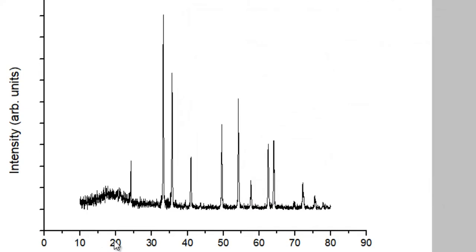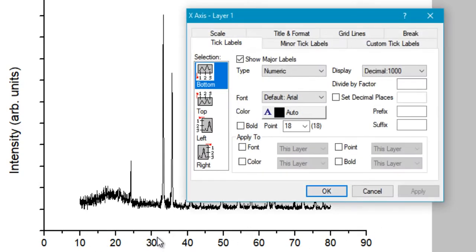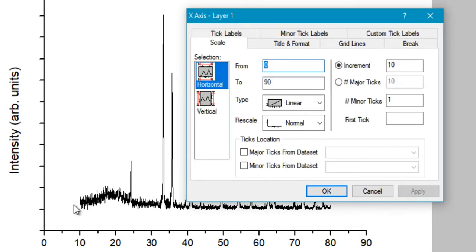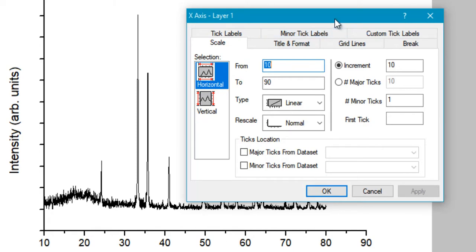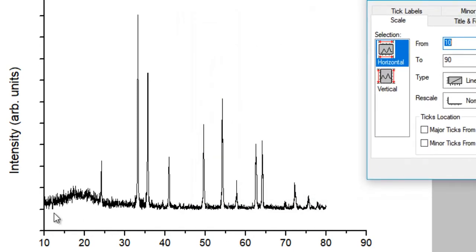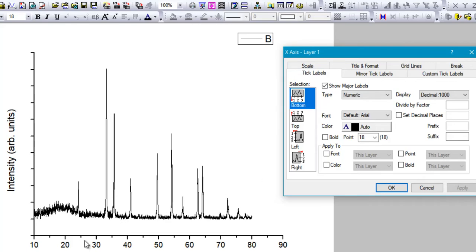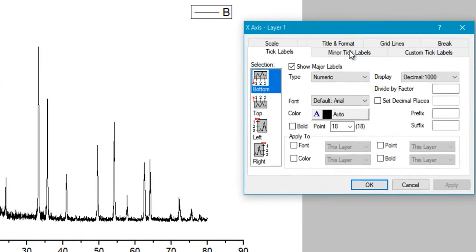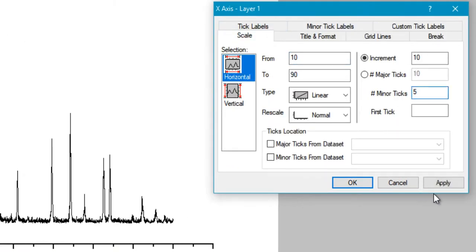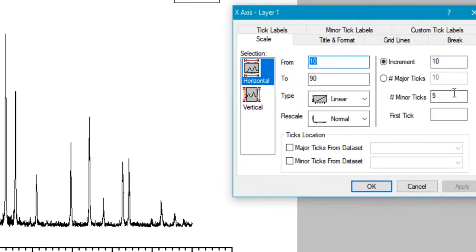Next, edit the X axis. Since my X-ray diffractometer scan started from 10 degrees to 80 degrees, I'd like the graph to start from 10 degrees. In the Scale section, select 10 and click Apply — that starts the graph from the correct origin. You can also go to Scale and set the number of minor ticks to 5 or whatever you prefer, or remove them altogether. There is a lot of customization available in Origin.